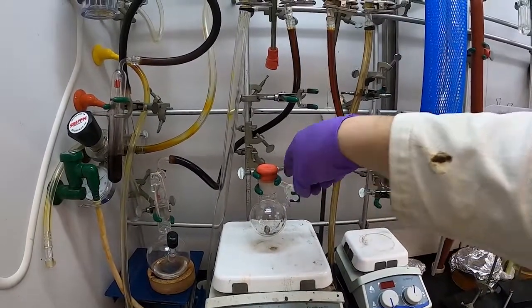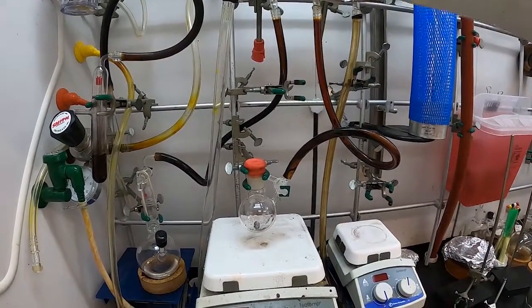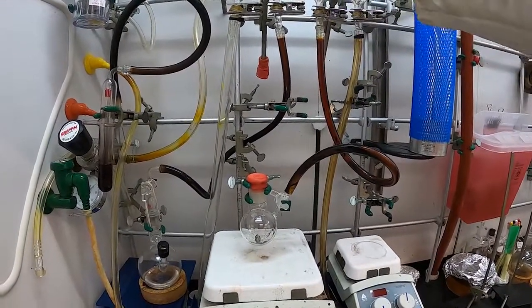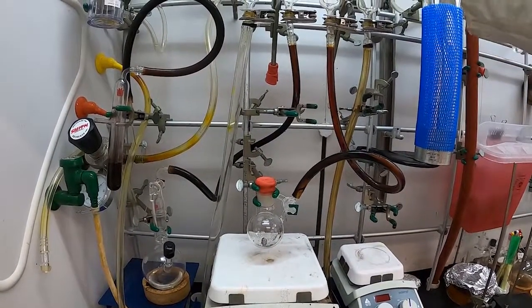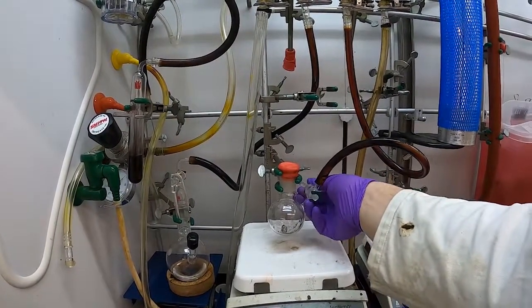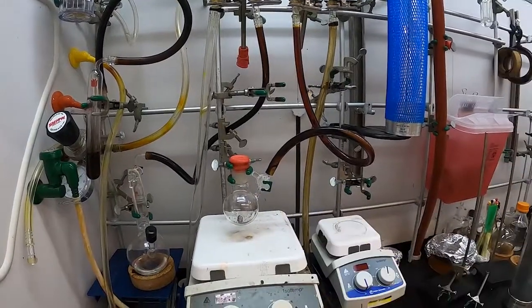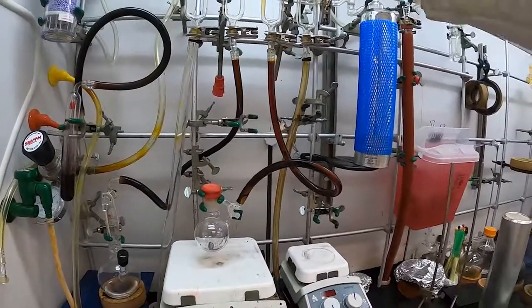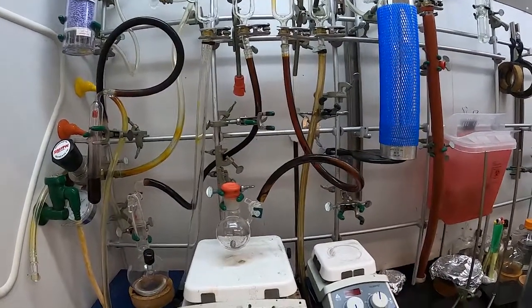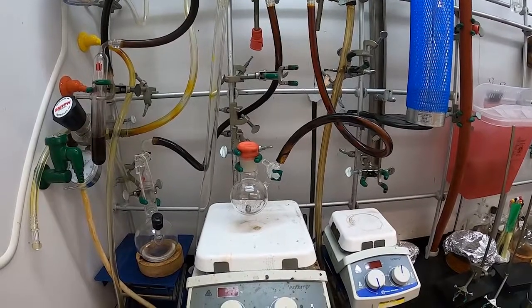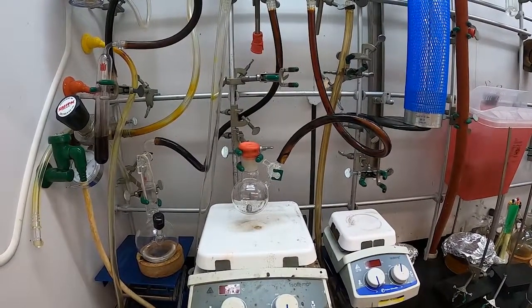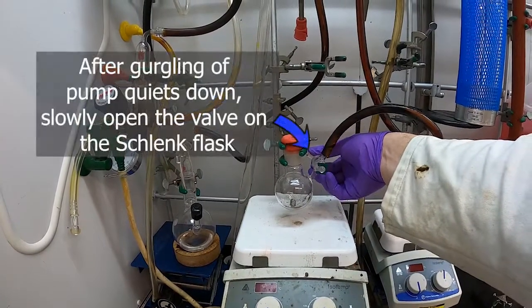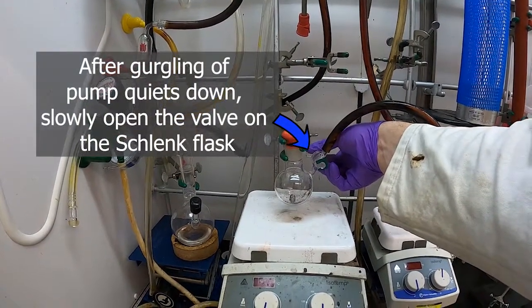So our key here is closed. So I'm going to open this to the vacuum. There we go. The gurgling of the pump should stop shortly. And here we go. And then once we've got vacuum in here, we can slowly open this key on our flask.